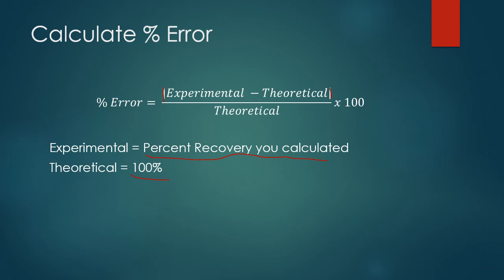Now notice there are a few theoretical concept questions after this calculation. The first one being talking about the compound dried in beaker 1 has a tendency to form a hydrate at room temperature. So we're talking about the calcium chloride.